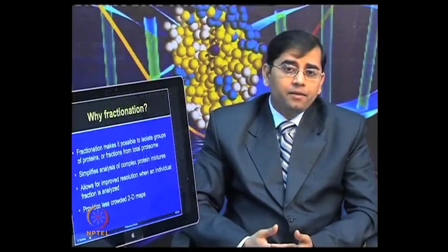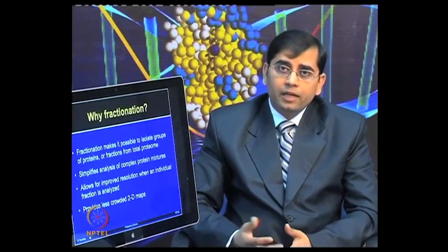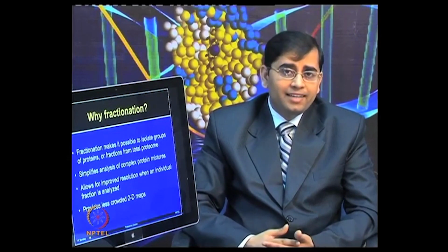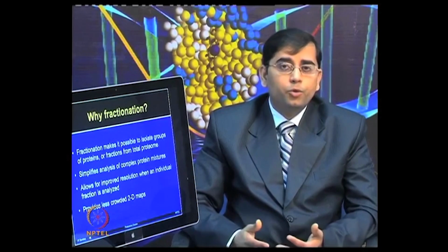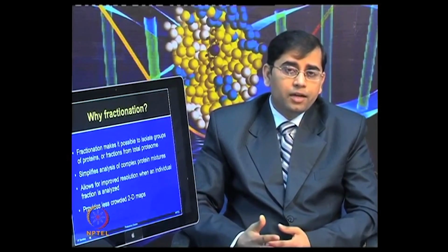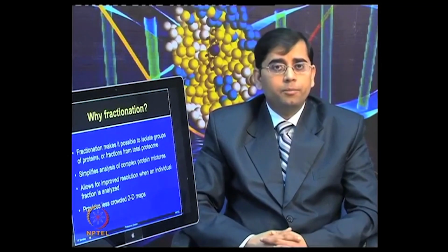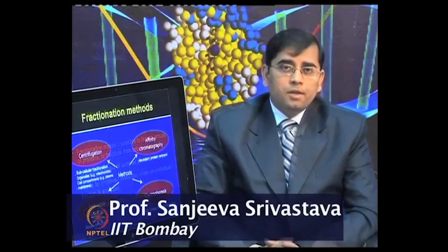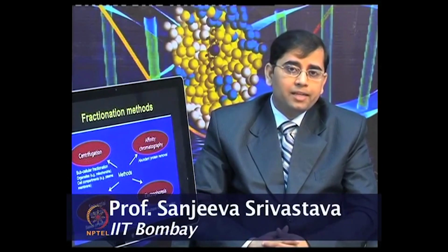When you are applying your protein samples on a 2D gel or other gel-based proteomic techniques, this will provide you a less crowded protein map. So, again, fractionation can serve a good need in both gel-based and gel-free proteomic applications. Let us talk about the different types of fractionation methods available.